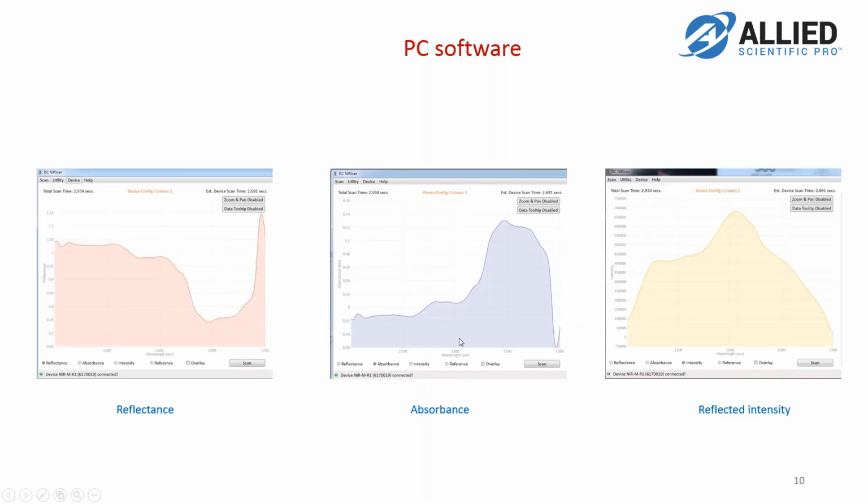and you can also record the measurements and later on refer to them. So here is an example of a measurement that was taken from a surface, from a paper or desk, and you can see there is the reflectance. So this is just the reflectance that has been measured from the surface, and then there's the absorbance mode, which is kind of complementary.